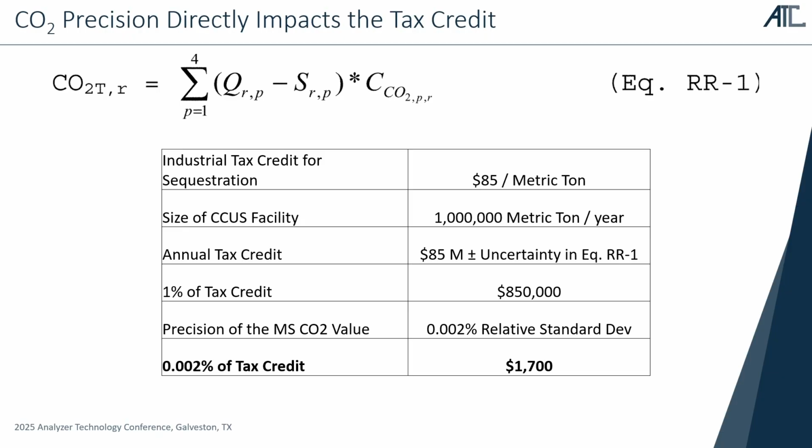If you can do the measurement with a simple GC configuration, then you're going to have a lower price point on your analyzer relative to the mass spec. But as that measurement gets more complex, if you have to have a TCD and then add an FID as well, now you're adding furnaces and columns, and the cost of that process GC starts to get much closer to the higher cost of the mass spectrometer.